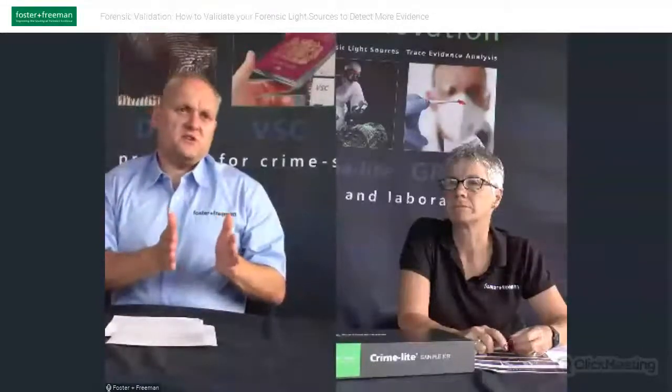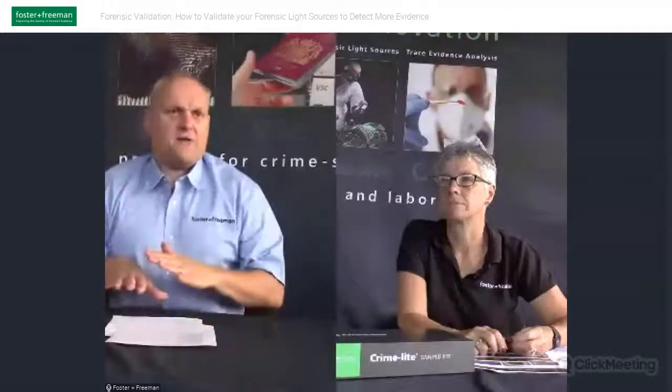The problem with the earlier ones, the sort of xenon and the metal halide ones, is that when you actually use a filter with them, you still have a very wide wavelength of illumination, typically 50 nanometers, maybe something like that. And that's not necessarily beneficial, because you don't want to excite everything. We're only trying to excite what we're finding, which in a lot of cases is the body fluid, for example. And the wider the excitation range, the more chance you have of actually exciting the background. And that's exactly what we don't want to do. We only want to excite the body fluid, but leave the background unexcited.